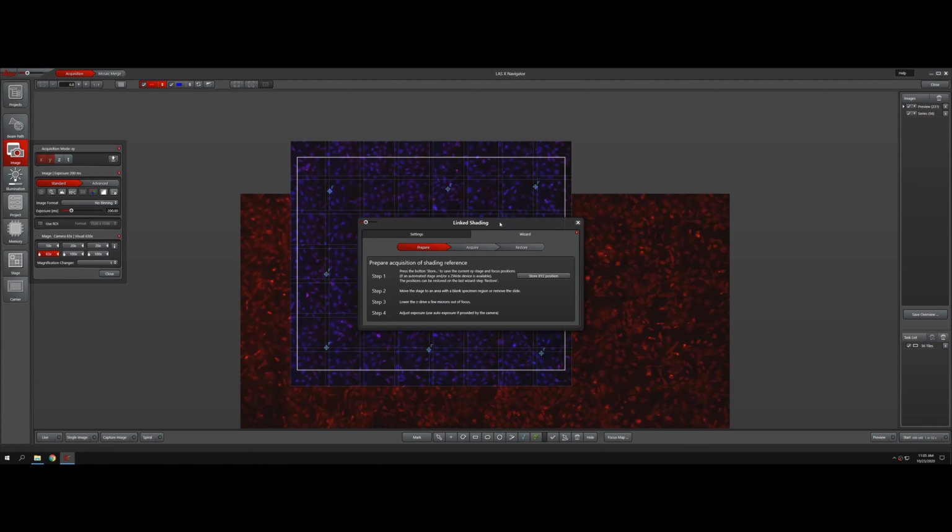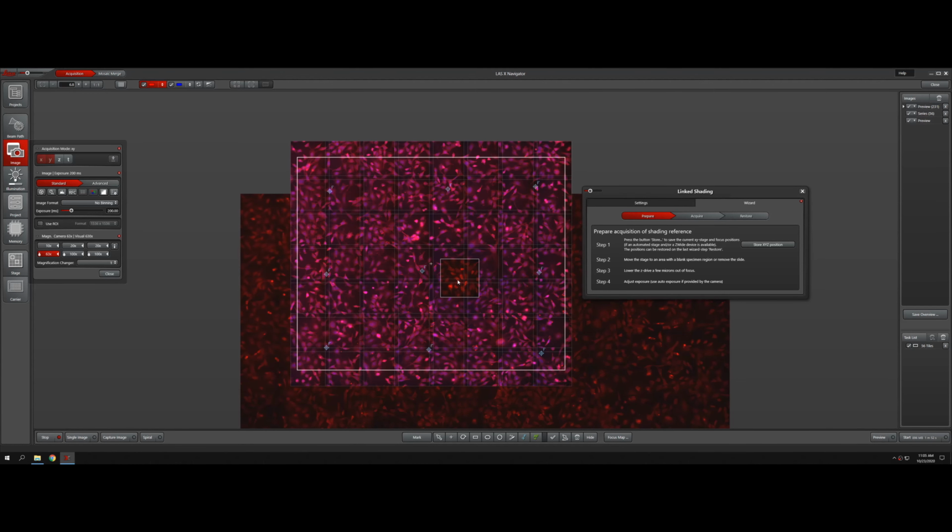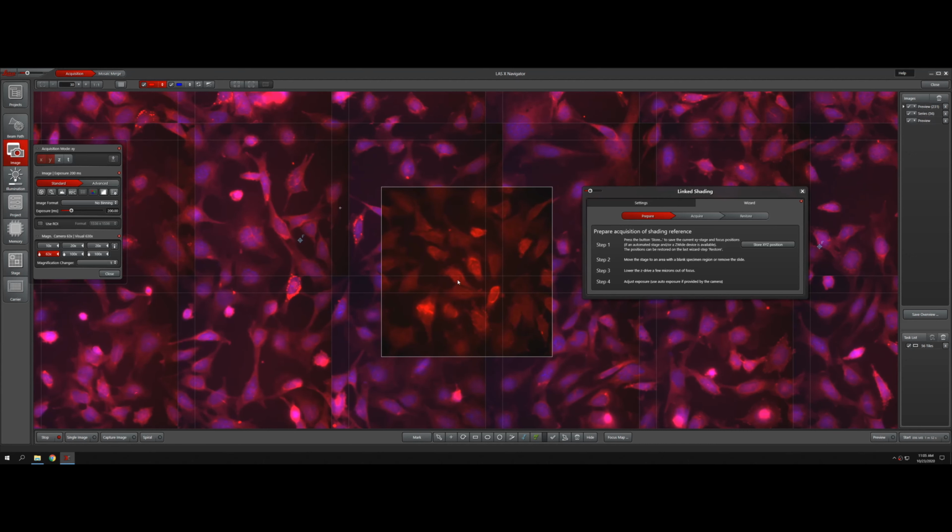If you remember, it said to go down, so I'm going to go live here. Alright, I'm going to lower the objective way down so that I pretty much don't see anything.